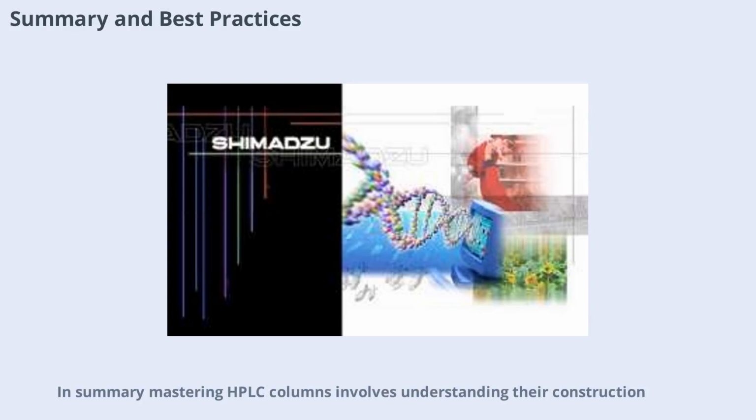Summary: mastering HPLC columns involves understanding their construction, choosing the right materials and dimensions, and following best practices for use and maintenance. By taking care of your columns, you ensure reliable, high-quality separations and extend the life of your equipment.